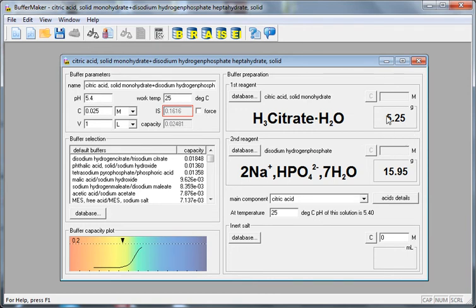This recipe can also be printed. More details about the program at www.kembady.com.